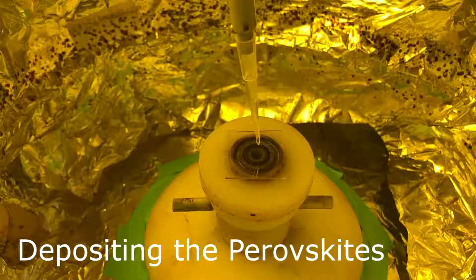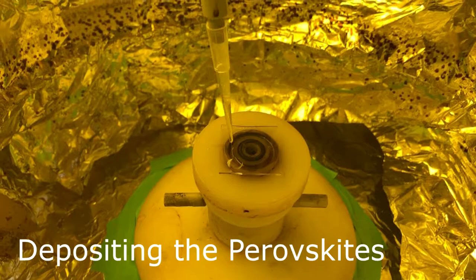Now we're ready to spin coat. We used a micropipette to spread the solution as evenly as possible, then set a program to spin at 1200 RPM for 45 seconds.